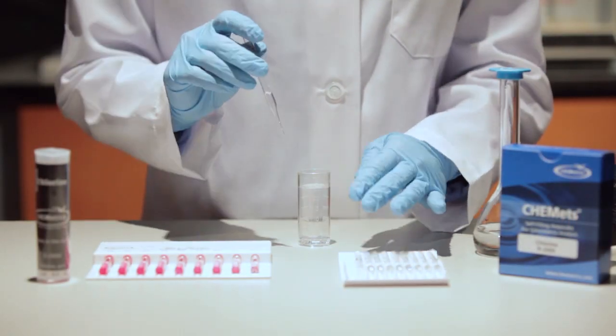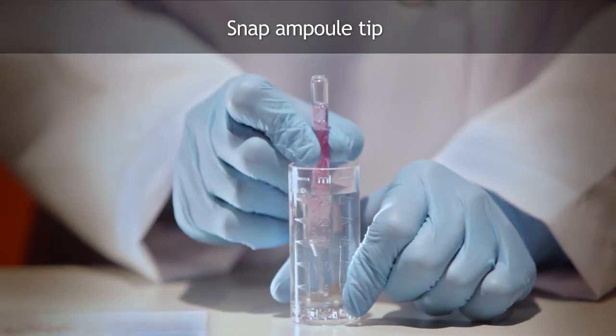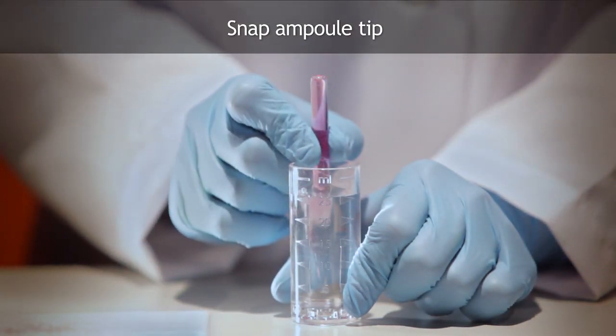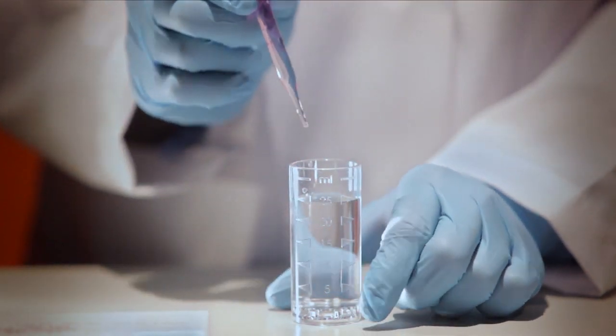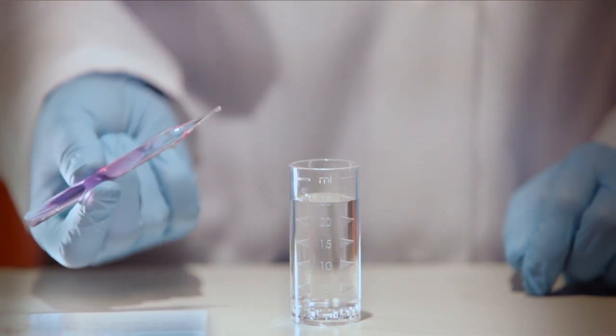Insert the tapered tip of the ampule into one of the depressions in the bottom of the sample cup. Snap the tip of the ampule by pressing the body of the ampule against the side of the cup. The vacuum in the ampule quickly pulls in the correct volume of sample.